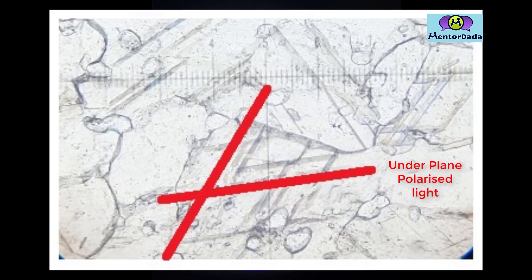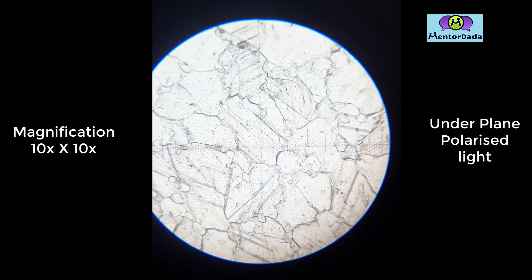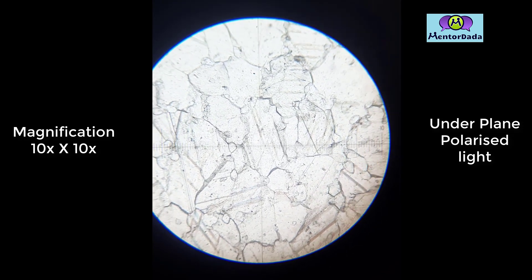As the mineral is cut along the basal section, the two sets of cleavage are not perpendicular to each other. There is no fracture seen in this thin section.